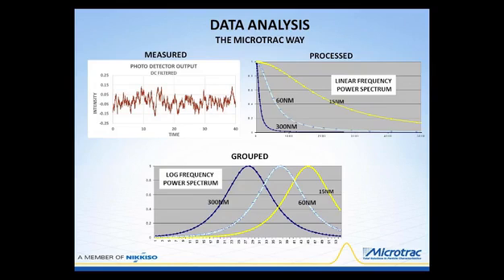So the power spectrum can be thought of as buckets of frequency range. In a linear power spectrum, you have equal size buckets.